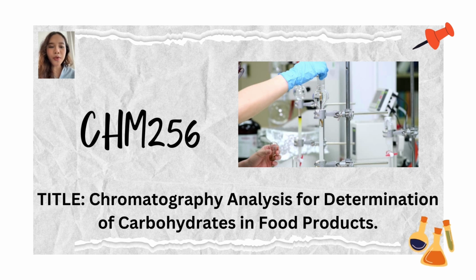In this video, we will be discussing chromatography analysis for determination of carbohydrates in food products, for example, yogurts.